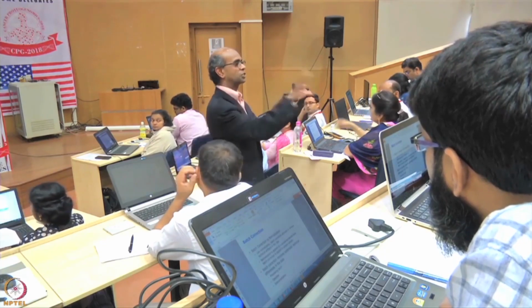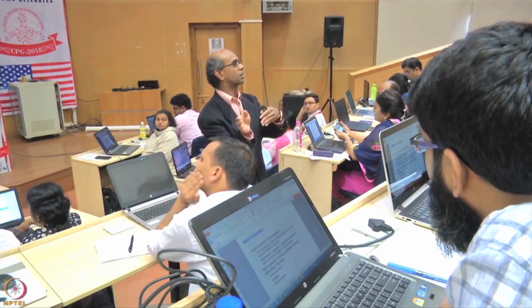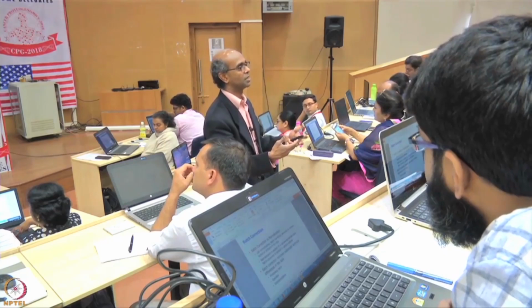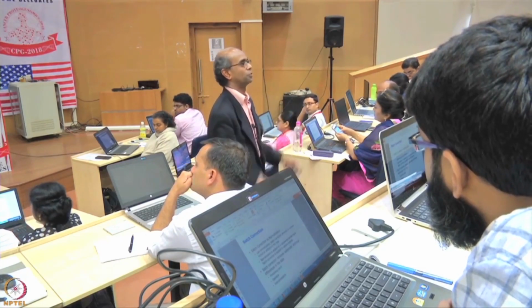If you are looking at each replicate separately, drawing some conclusion and checking that conclusion across, you don't need batch correction. But if you are combining all your replicates and doing a unified statistical analysis, then hopefully you would have randomized your replicates, but if you didn't, you would do batch correction.